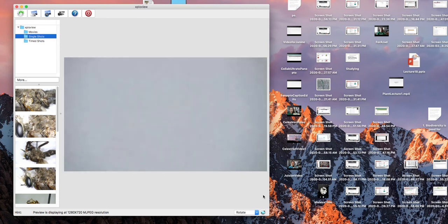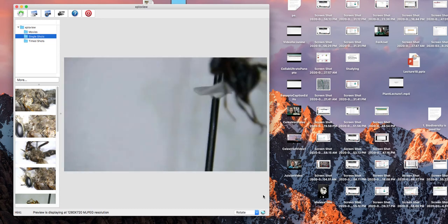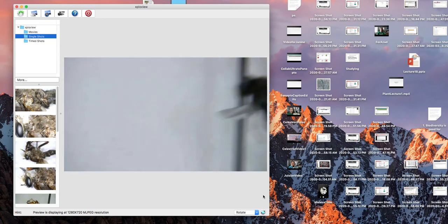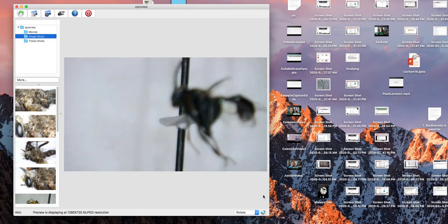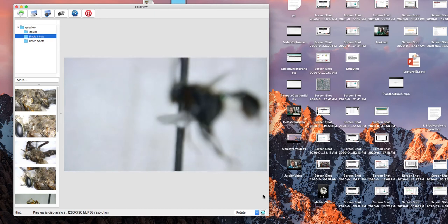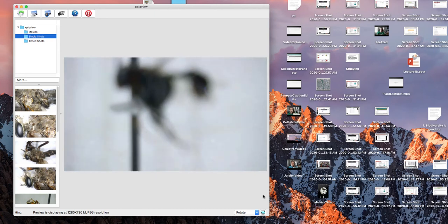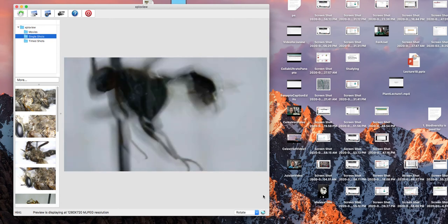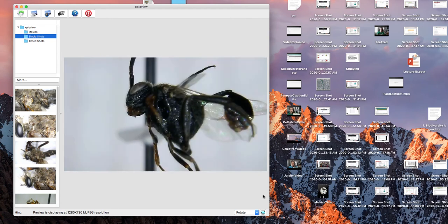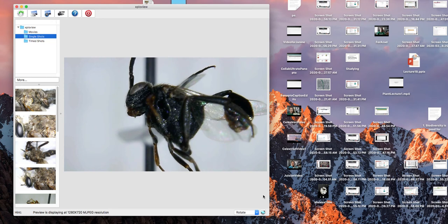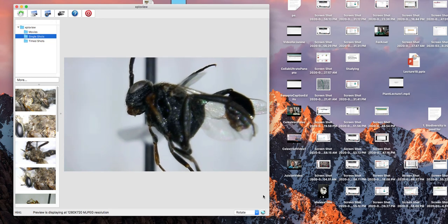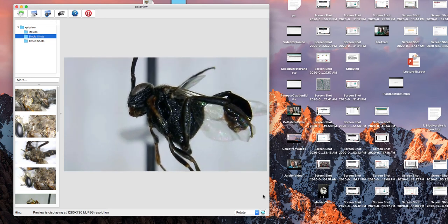So let's bring this down even further. I'm going to bring this down. You can see it's getting brighter. Let's do some focusing. This might be the sort of insect where you would be benefited by actually having a diffuser to actually diffuse some of that light because it is a very, very shiny, dark insect.